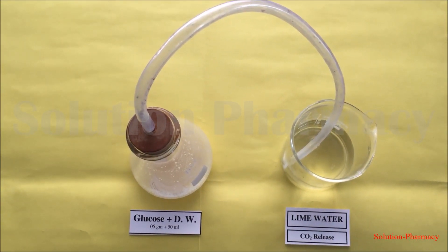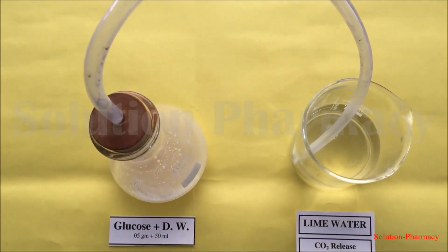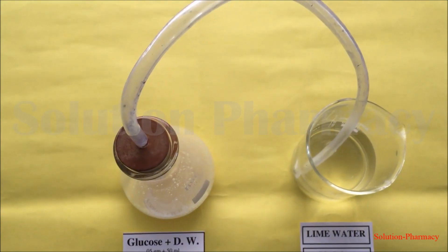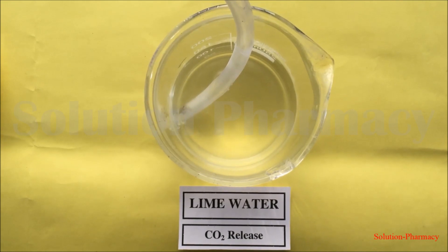After a few minutes, when the fermentation process starts, the carbon dioxide gas formed during fermentation passes through the tube into the lime water. The colorless lime water turns milky, and this is due to the formation of calcium carbonate. You can see the carbon dioxide gas evolving in the form of bubbles.